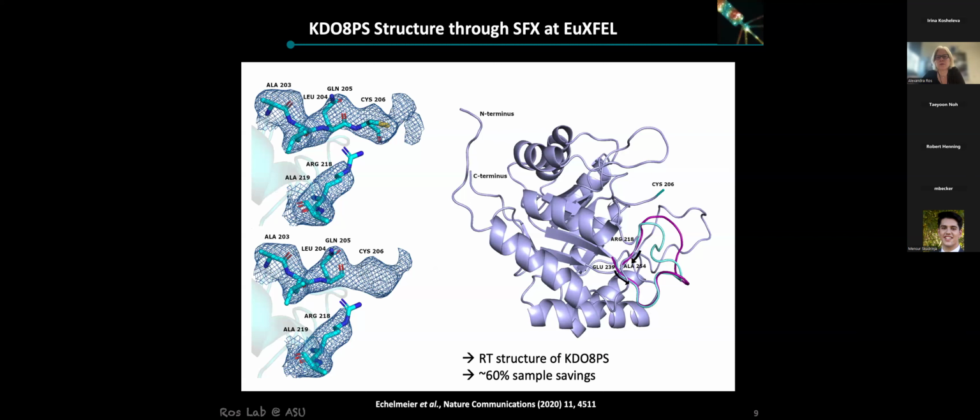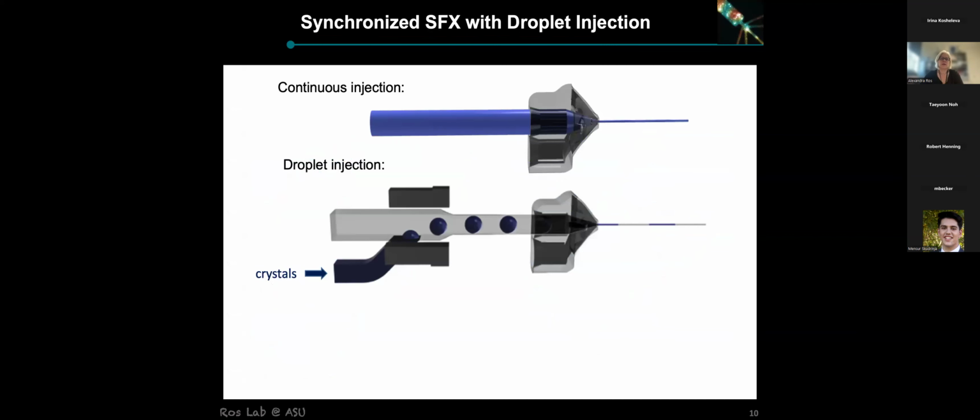that I mentioned earlier. So in the continuous injection, let me come back to how we are going to realize that. Again, related to continuous injection, we want to generate our droplets in our droplet generator. And in order to achieve synchronization now, what we do is we add electrodes here that allow us to use electrical stimulation to release the droplet.